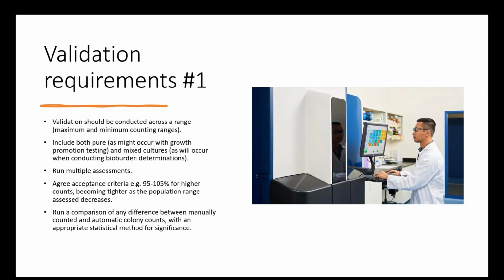There needs to be an acceptable range of error, whether it's plus or minus 1 colony or no acceptance, or whatever the criteria for undercount or overcount is. And that needs also to be assessed in terms of a suitable confidence interval and a statistical test for significance. And there are different ways to approach this.